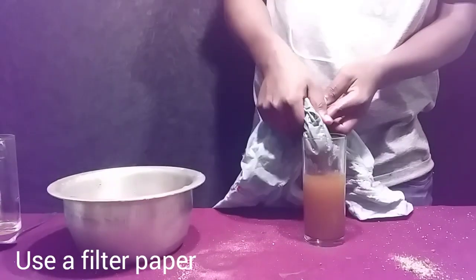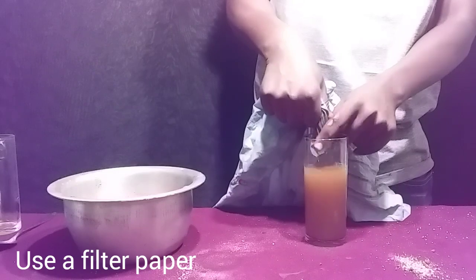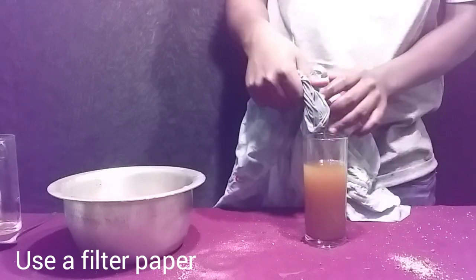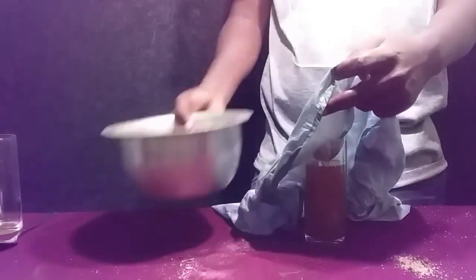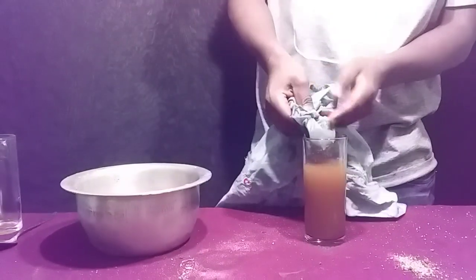For you, I would recommend using a filter paper. The filtration process will take longer, but you will at least get a clear solution compared to mine.